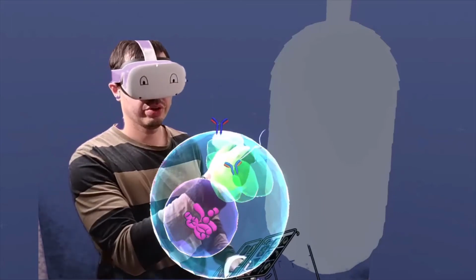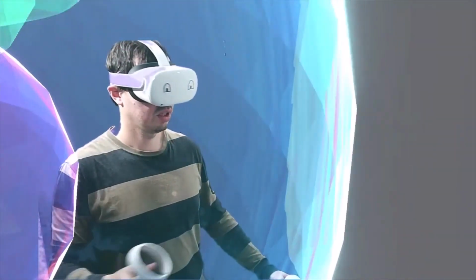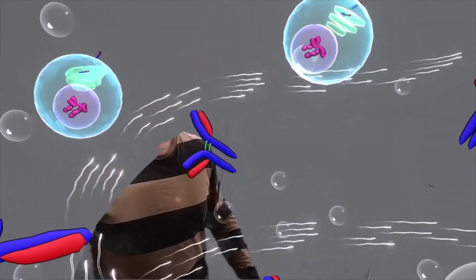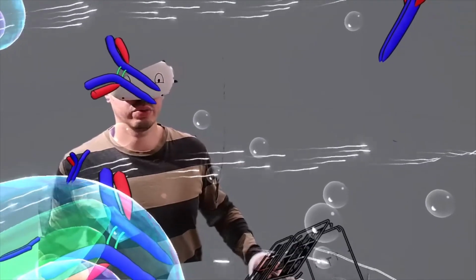Now, if we go inside the bioreactor to see what it's like in there, I'm going to take you inside the bioreactor with me. There. Bioreactor is the place where you grow your cells.